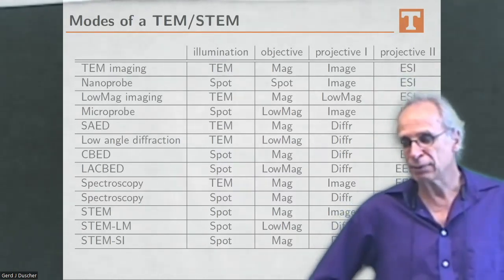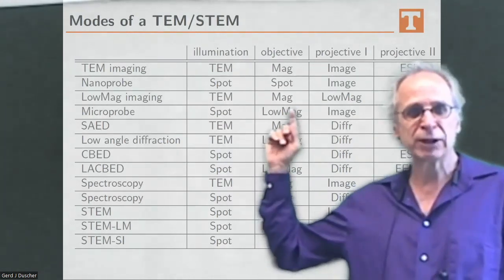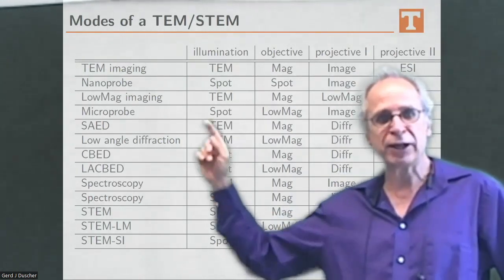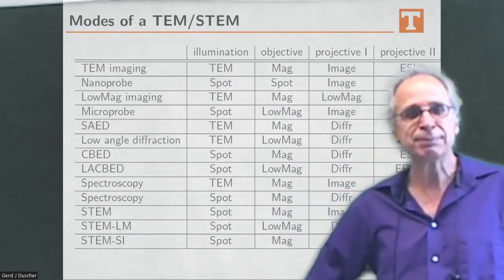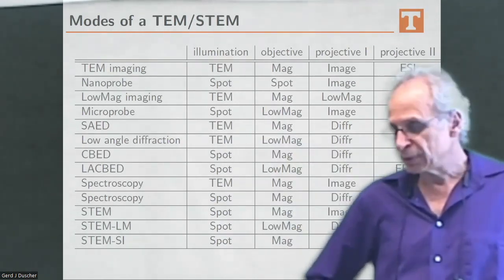So if we do the different modes of a TEM, in normal imaging we are in a parallel illumination, right? Most manufacturers call it TEM.